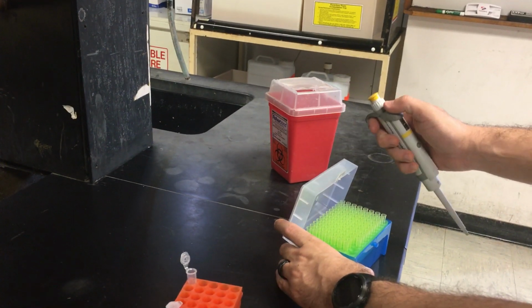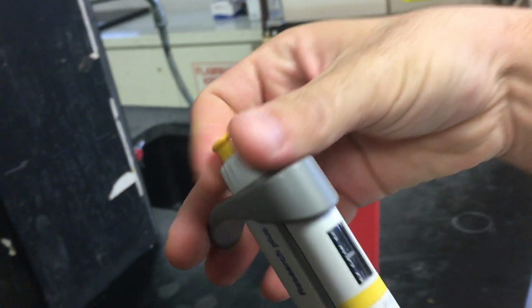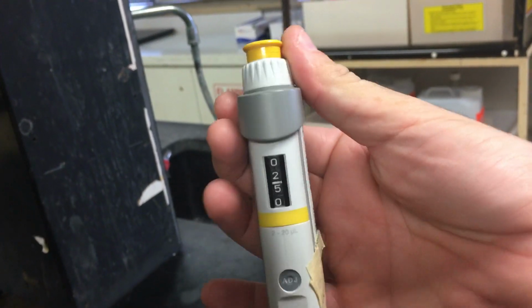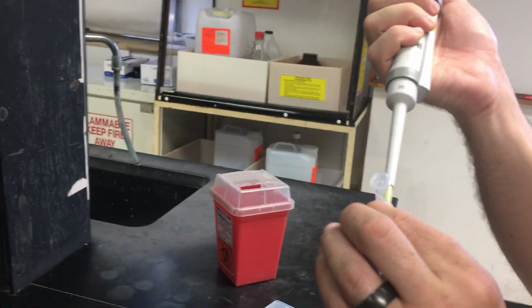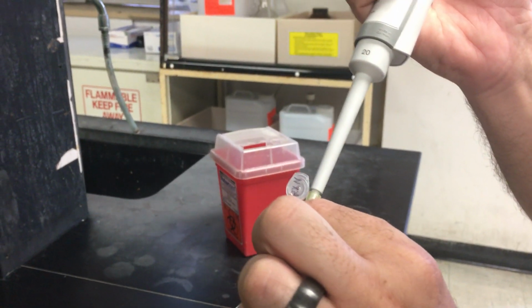So instead, we're going to be adding now our 10x BSA, and instead of 5 microliters, look at that, he's changing now with the other ring to 2.5, okay? Because remember, the final volume will be 25 microliters, so if it's a 10x, it's 2.5. And again, the same procedure, you add, up and down.